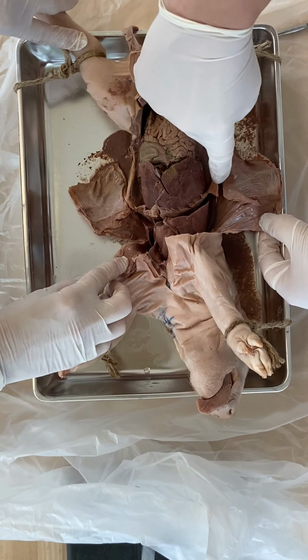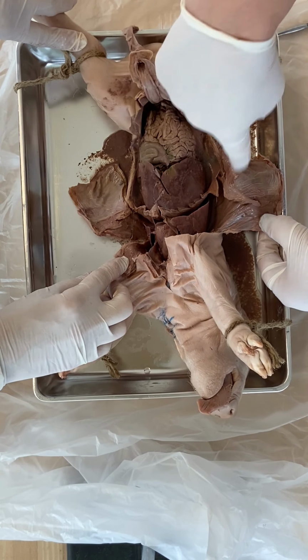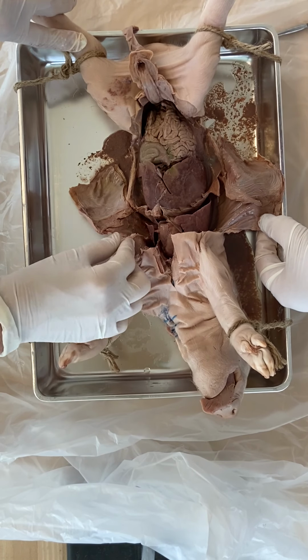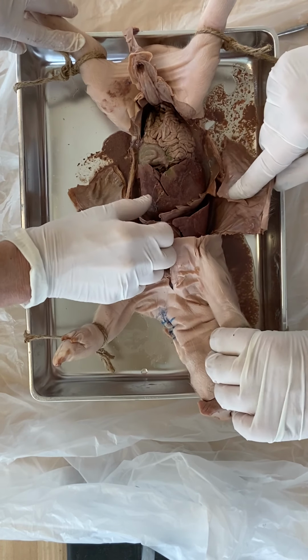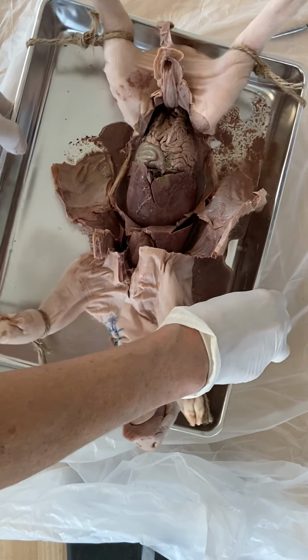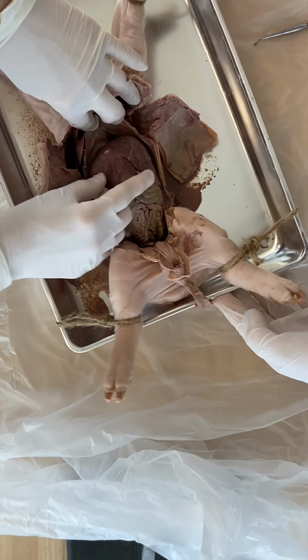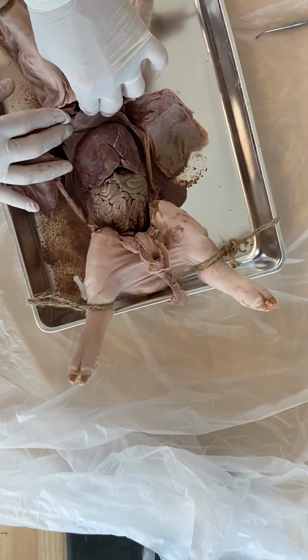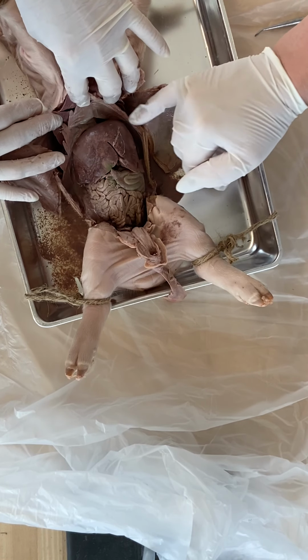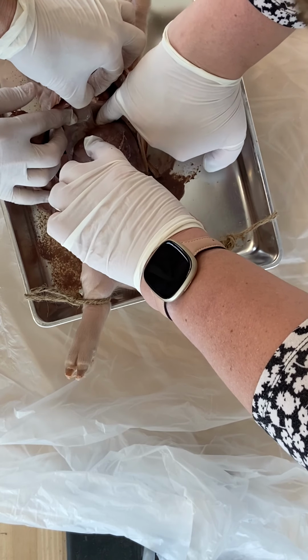So when we did the digestive system, we showed it going over the top of the liver. And when we did the respiratory system, we showed it at the bottom of the respiratory system. So there we have it. There's the diaphragm. And if we turn this around, they can see the diaphragm really nicely right there. And the esophagus comes through somewhere up in here.